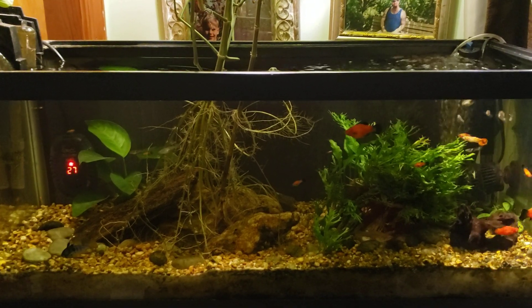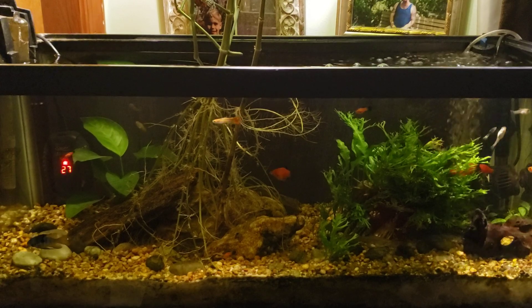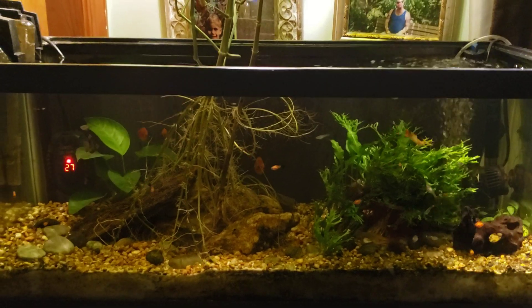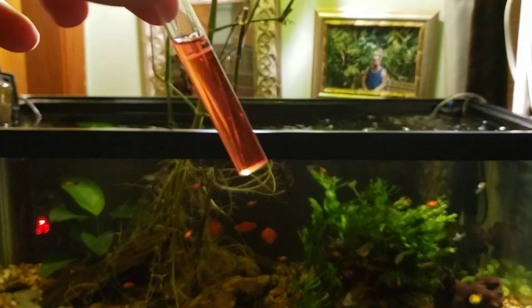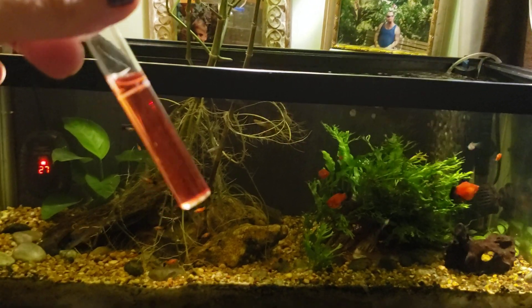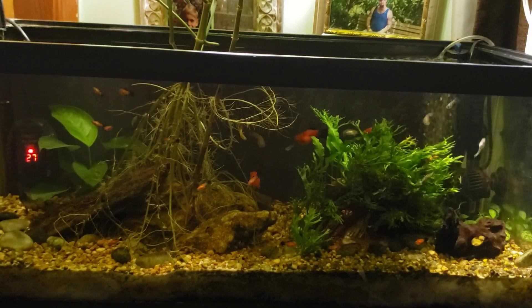I scooped eight ounces of water out of the tank and then added eight ounces of fresh tap water, which simulated another 50% water change. This is what the nitrate now looks like — and I know it's kind of hard to tell just holding it up in the air like this.